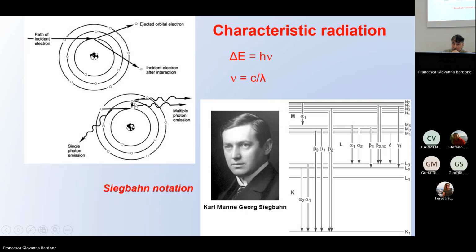But even if this electron jumps here, this electron leaves a hole here. So there is a probability of another electron from another orbital to jump here. And in this second jump, there is a production of another X-ray. So after one ionization of an in-core level, you have a huge amount of jumps of electrons to these holes created by ionization, which produce a huge amount of different types of lines.